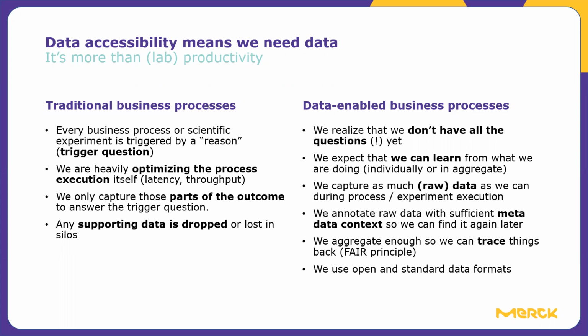So in a data-enabled business process, the first thing we do is we admit that we don't know all the questions yet, that we will be able to answer based on the data we're generating. However, we have the expectation that we can learn from what we are doing, either by looking at individual experiments again later, or by reviewing them in aggregate, looking at trends, looking at patterns. And to facilitate that, we need to think different about the data capture during the process execution.